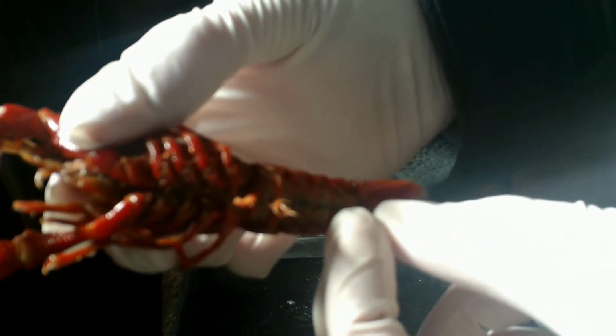So if you look. Let's see if I can get it. There we go. That's probably pretty good. Right here, if you look at this area right before it comes to the tail, that's where the sex organs are located.